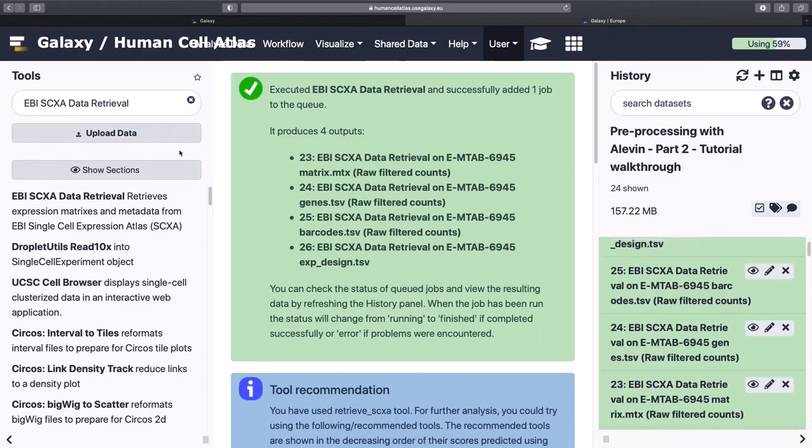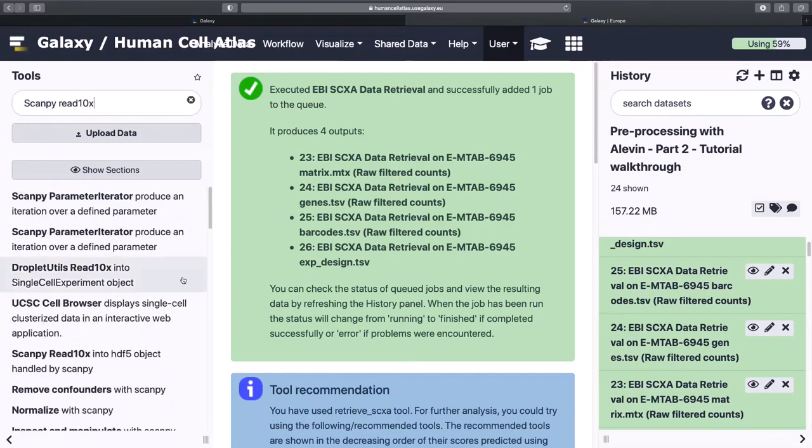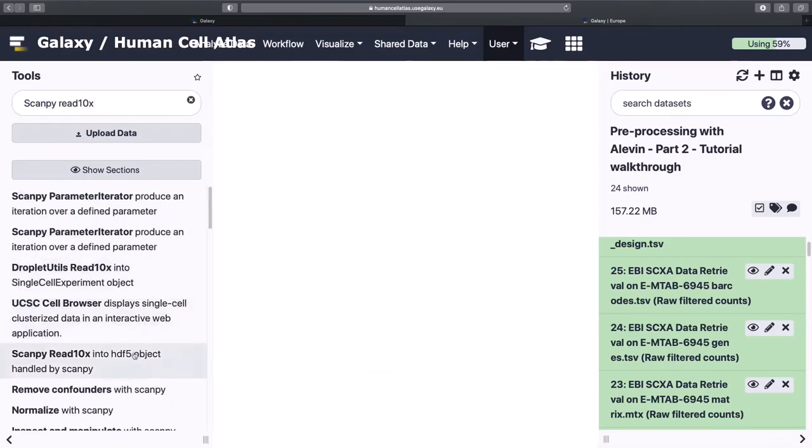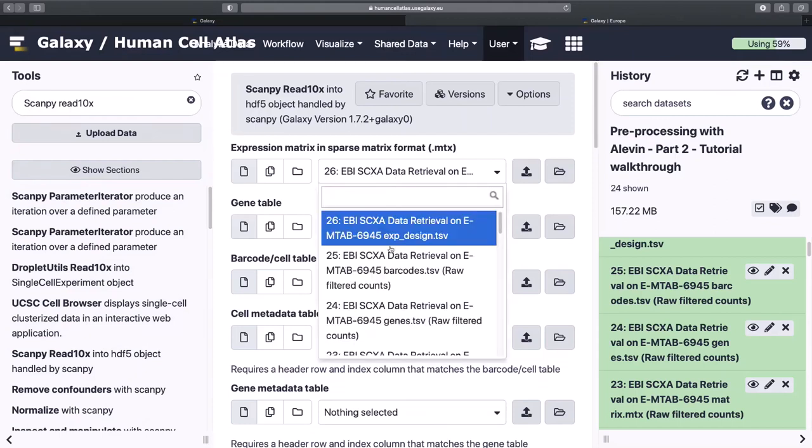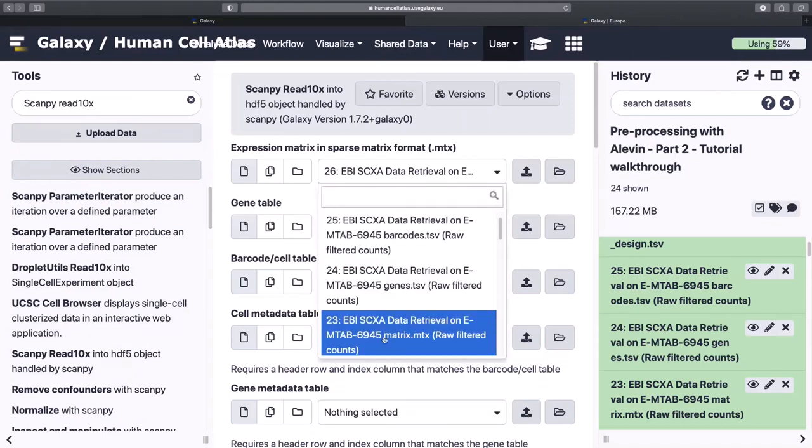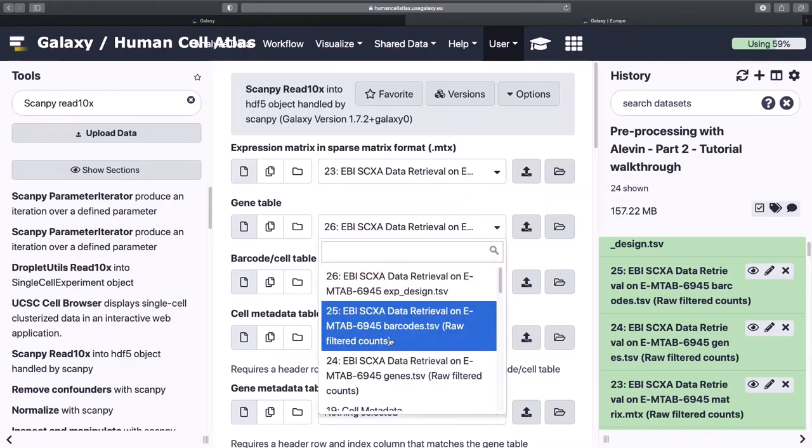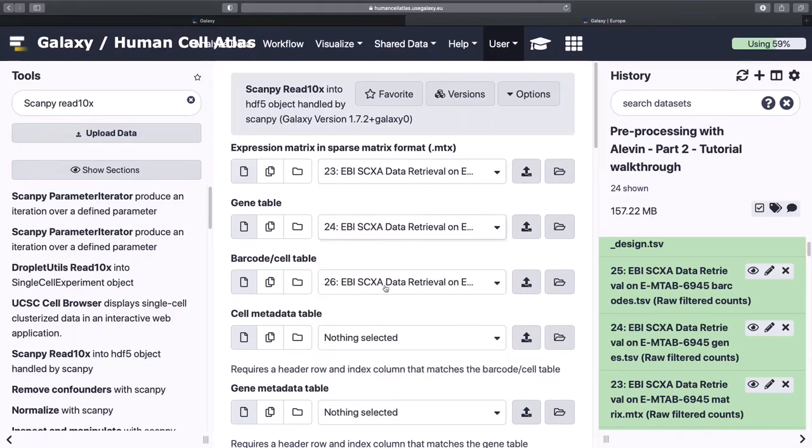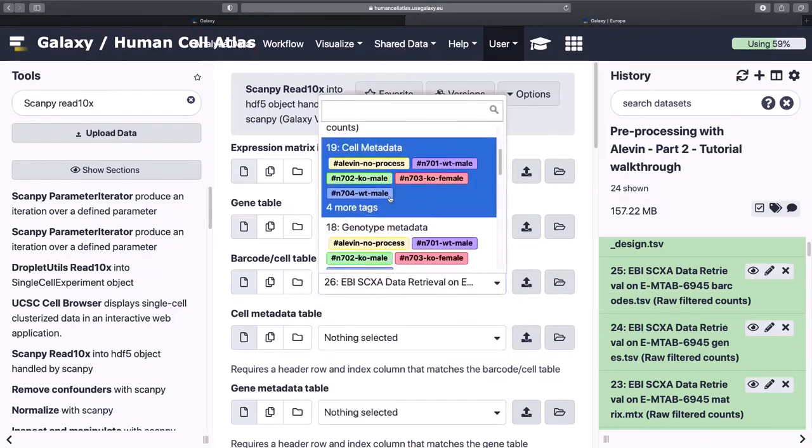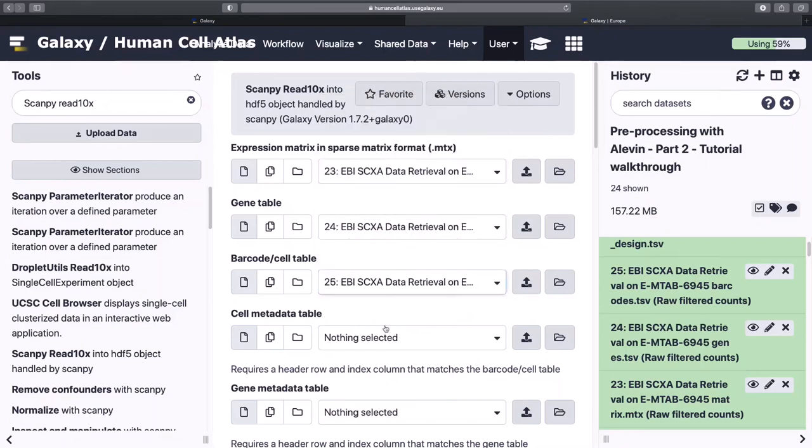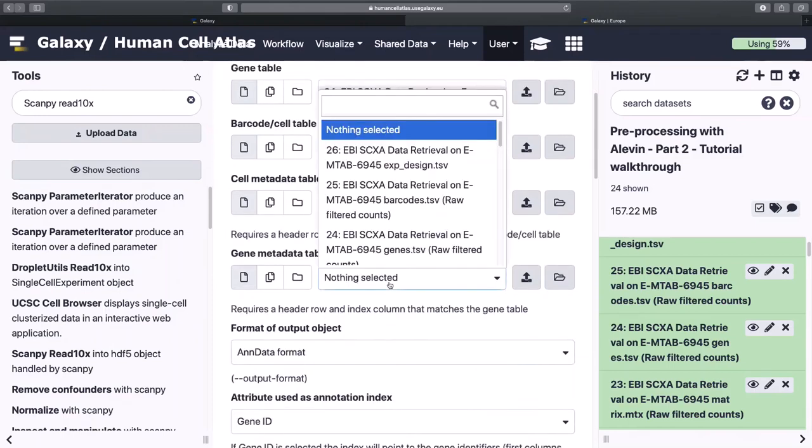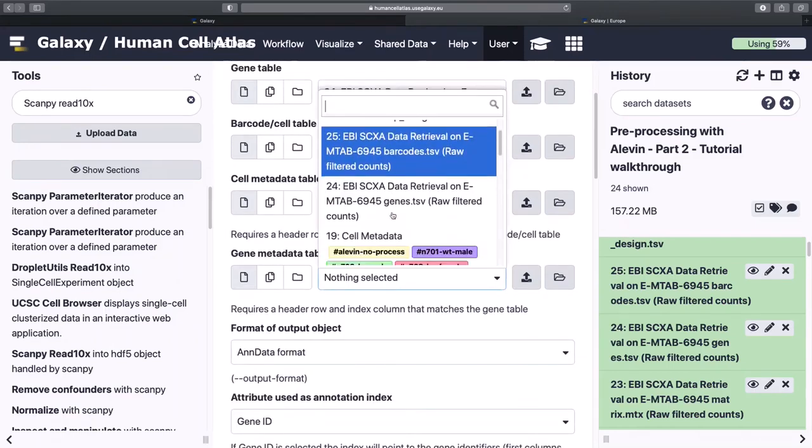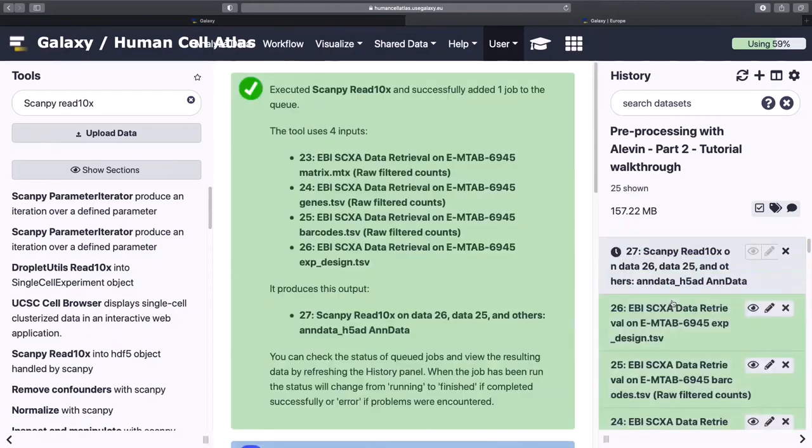And then it's not in the format that you want. So we have to read it in and that's fine. So we pick our matrix and our gene table and our barcodes. And keep in mind, these will have already had some extensive filtration on them. And then experimental design goes there. So the data will look a little bit different because it's already had that preprocessing.